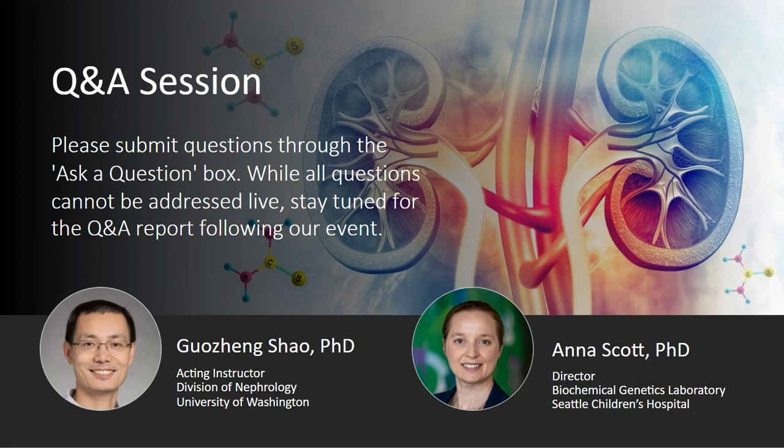Our cost per sample once the instrument is set up, I'd say is actually a little bit higher, but the upfront cost of the mass spec is pretty daunting. So each has its pros and cons, and I think the technology that is appropriate depends on the needs of the laboratory and the resources of the laboratory.